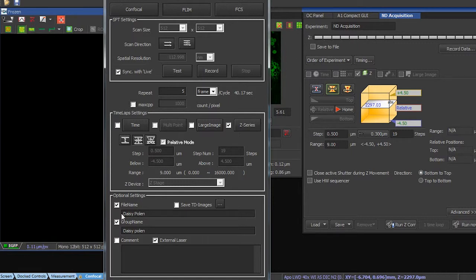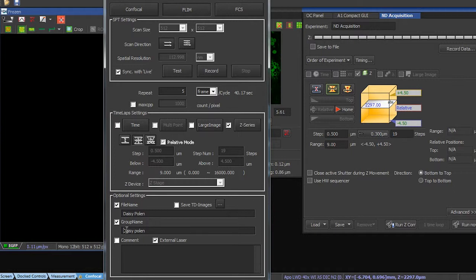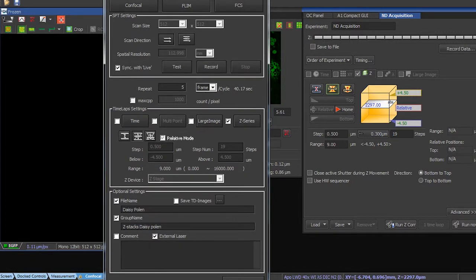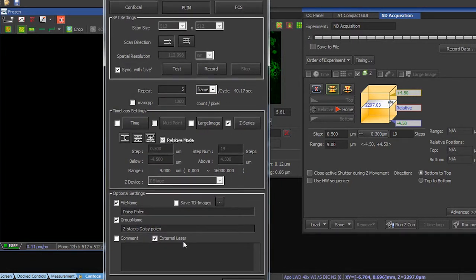And all those different z-stacks are going to be grouped in a group name, and this I can also name, for example, z-stacks. So once all of this is set, the only thing to do is to run the acquisition.